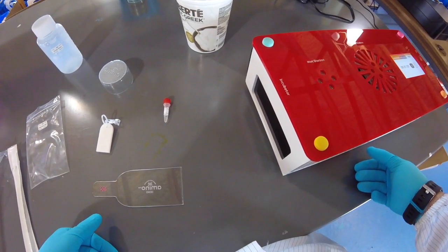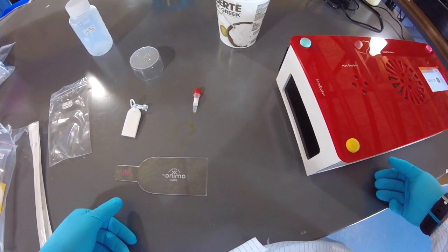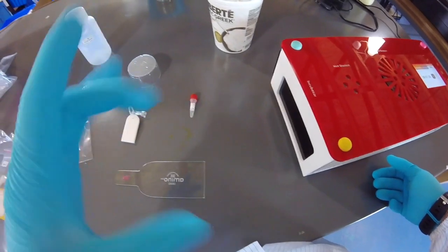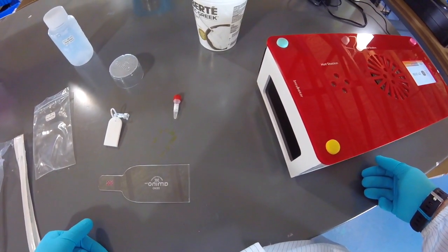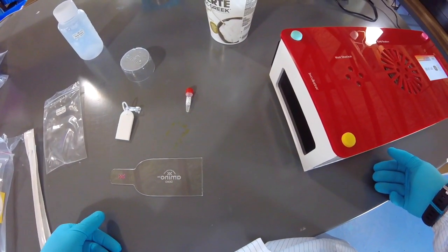Okay, so wait 48 hours. You can look in between and see how they're doing. Take some pictures in between, maybe see how they grow through time as well. And usually up to 72 hours. 72 hours should be more than enough time to start to see them, okay?